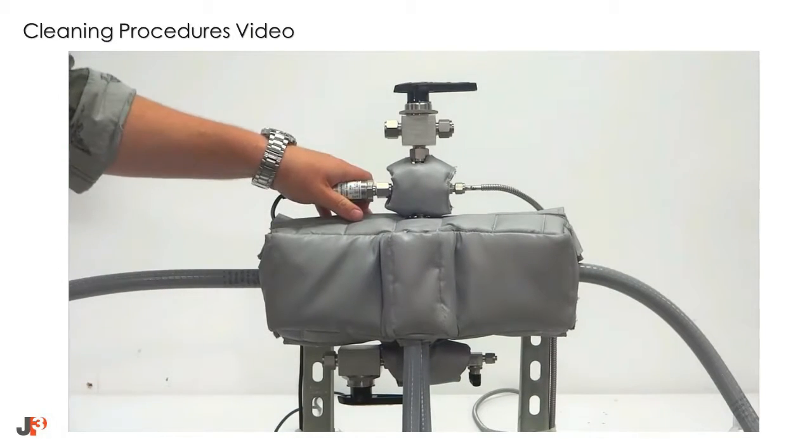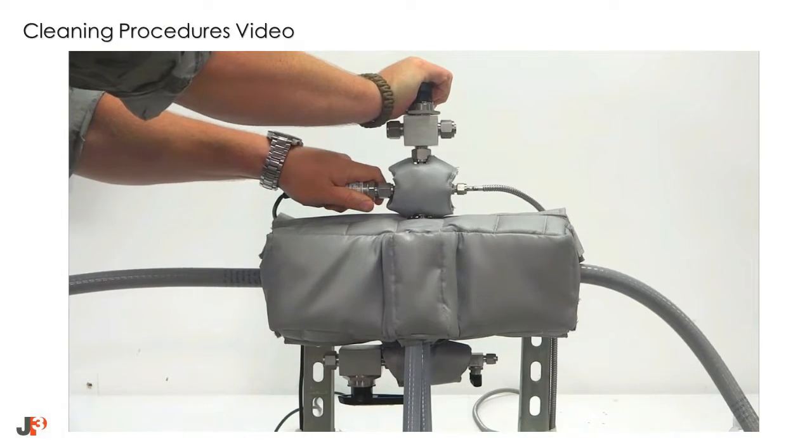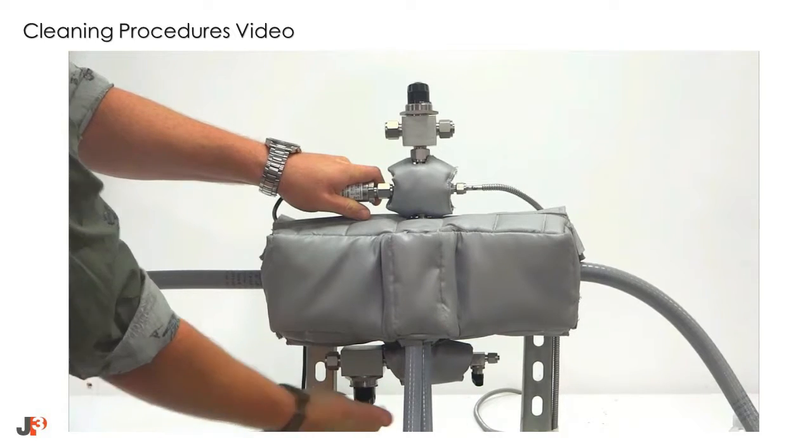The first step in the cleaning process is to isolate flow to the flow cell and to de-energize the heating block and allow it time to cool. Make sure to follow site-specific procedures including lockout tagout if necessary.